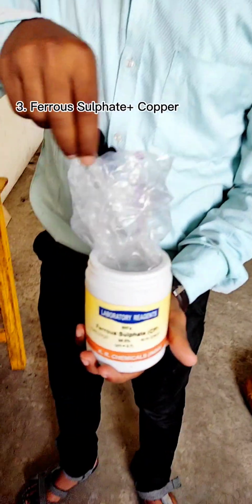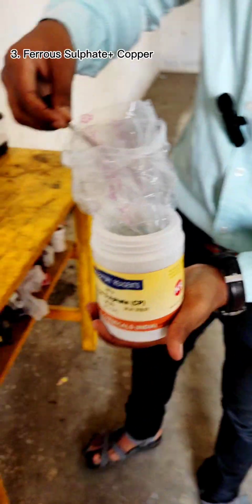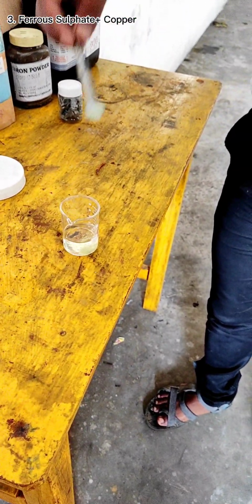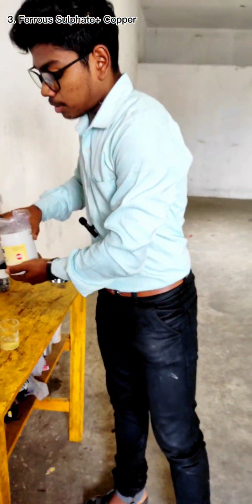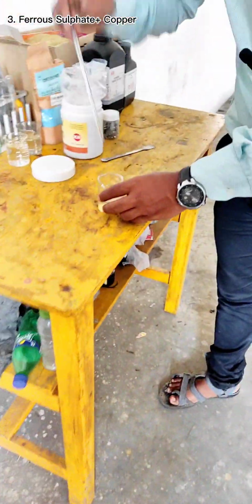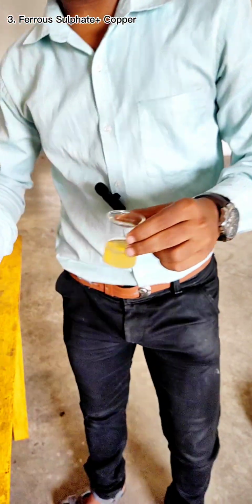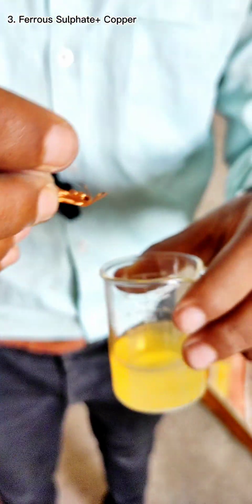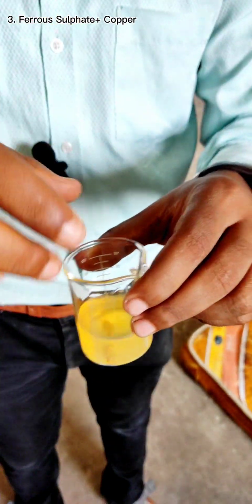So we will take some amount of ferrous sulphate into this beaker, and we will see whether copper displaces ferrous in ferrous sulphate solution. And this is our copper wire. So we will check whether copper will displace ferrous or not.